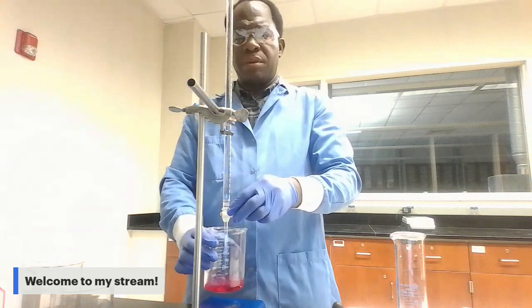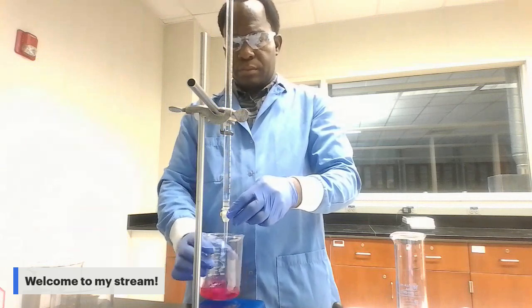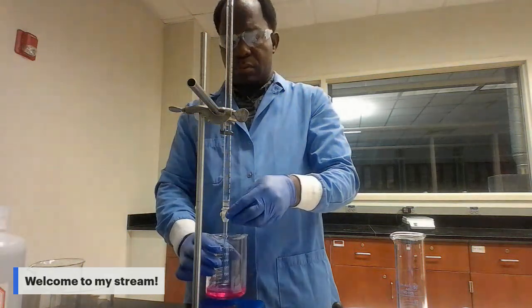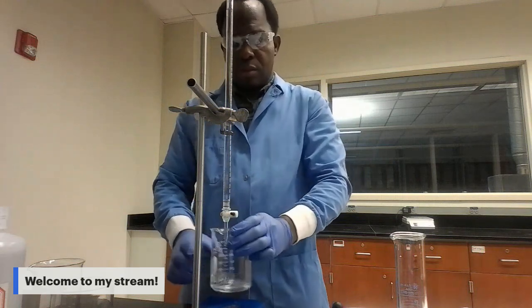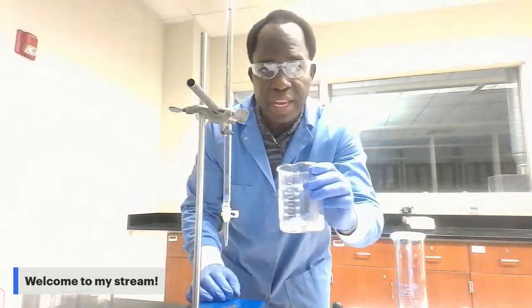It's going down. Okay, so we get to equivalence. The color of the solution changes to clear.